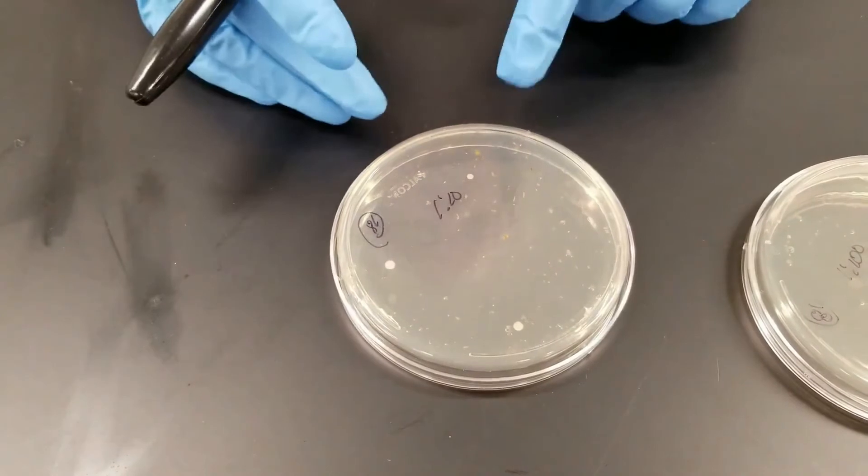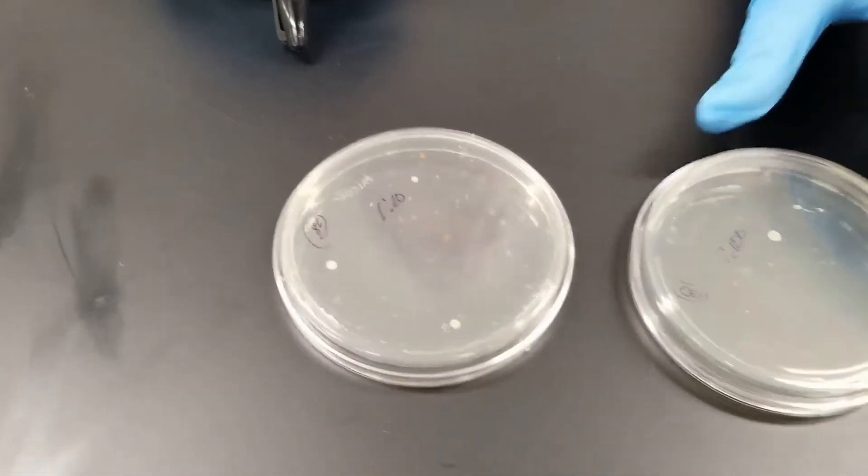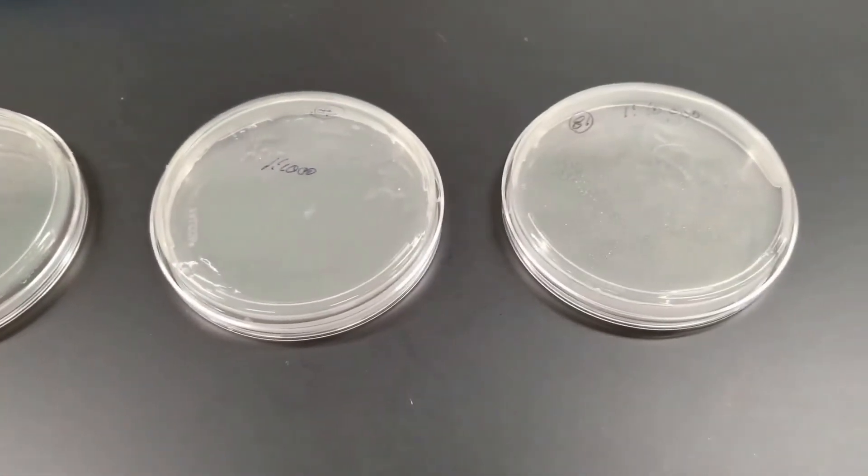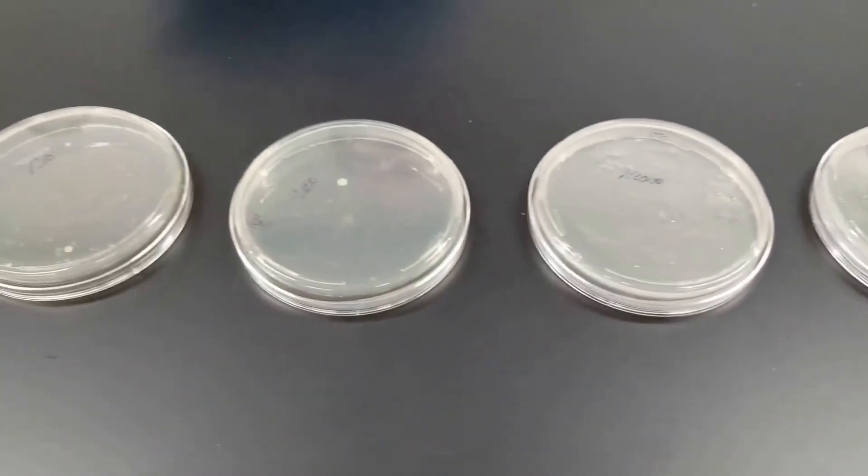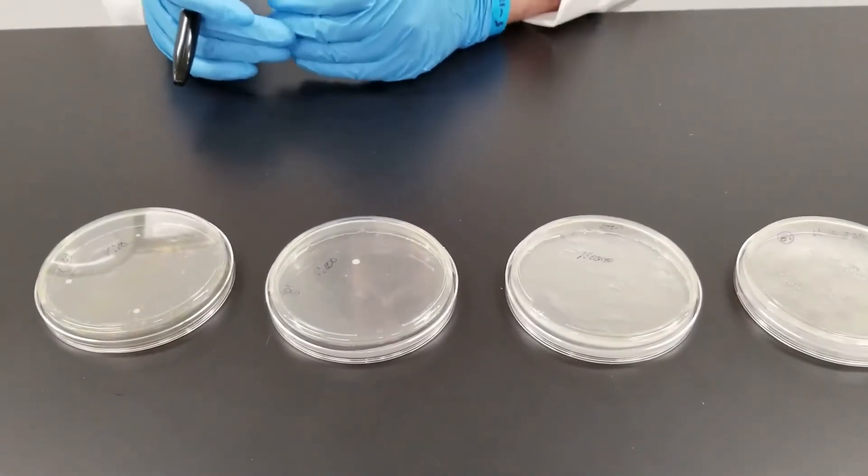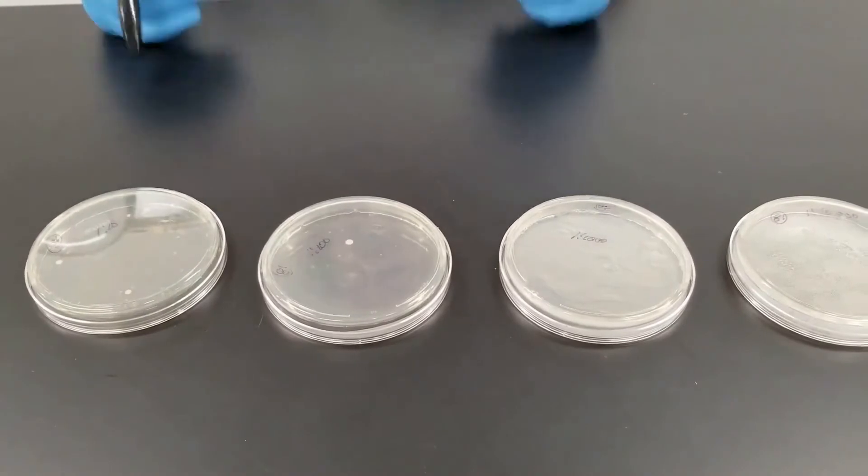The concentration on the plate is a 1 to 10 dilution. Then we have a 1 to 100, 1 to 1,000, and 1 to 10,000. Our idea for this, we're trying to determine, in this case we use the strawberry slushy, how many bacteria per gram or per milliliter of the slushy drink, the strawberries.